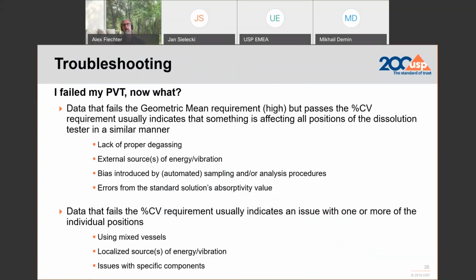External sources like vibration could be the cause. If you use the dissolution tester in an automated procedure by introducing the tablets automatically or taking the samples automatically, consider this to be a variability, because none of the labs that have done the tests for us in a collaboration to establish the specifications used an automatic procedure. The procedure is based on manual equipment. Everything is taken manually, hence the results are only to be compared against the same procedure.